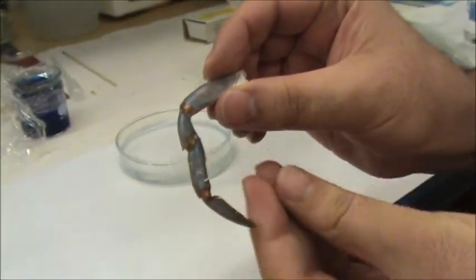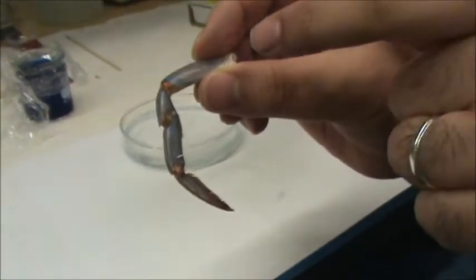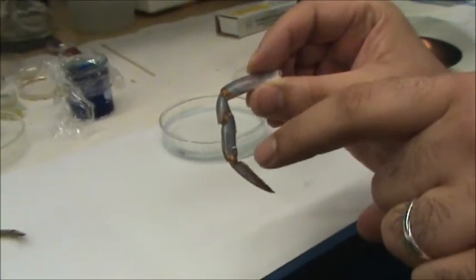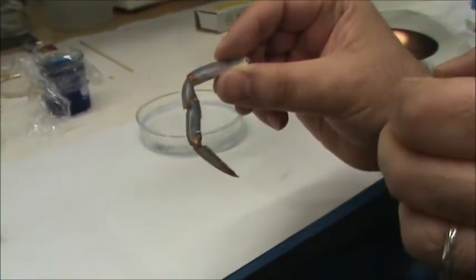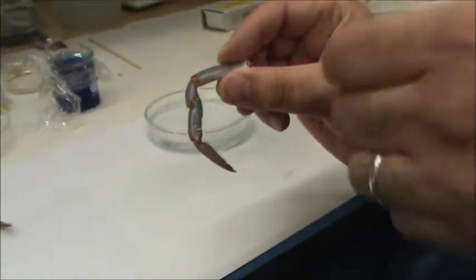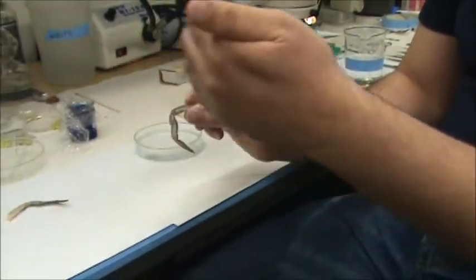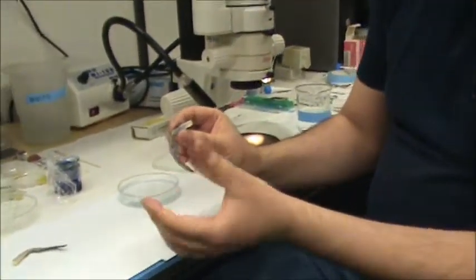I'll show you how to dissect this preparation and how to use methylene blue to stain the prep, because at the beginning we have to use methylene blue to see all the nerves and muscle fibers, because the tension nerve that you are looking for in this lab is very small. If you don't stain it at the beginning with methylene blue, it will be very difficult to find it later on when you do electrophysiological recording. But here, when you use methylene blue, you don't have to worry about the electrophysiology because we will dissect another leg to do electrophysiology.